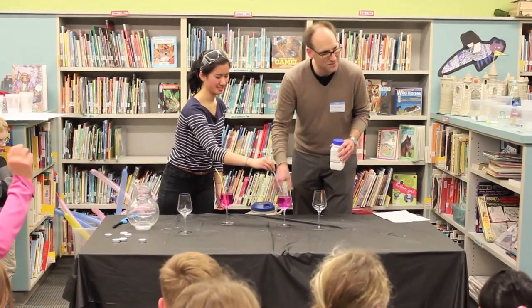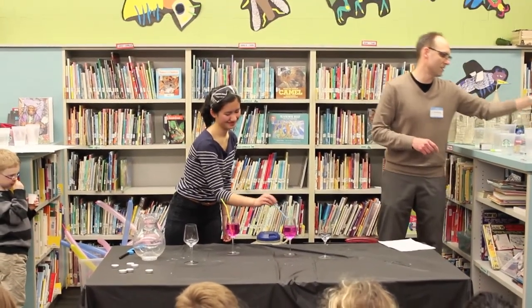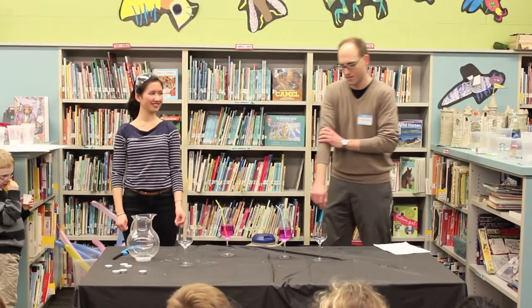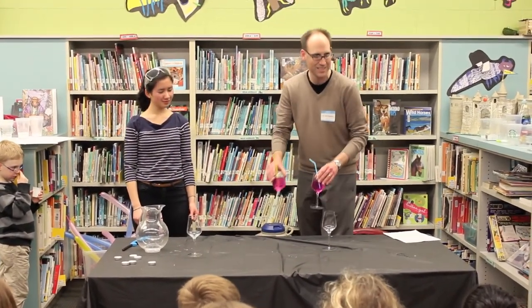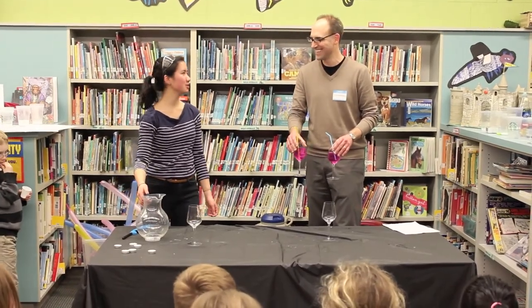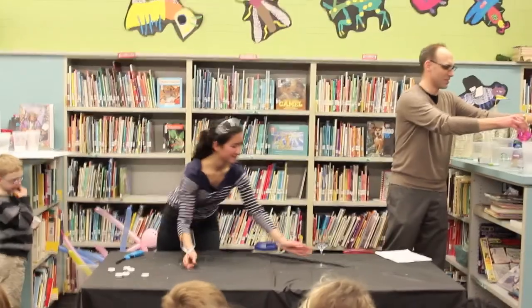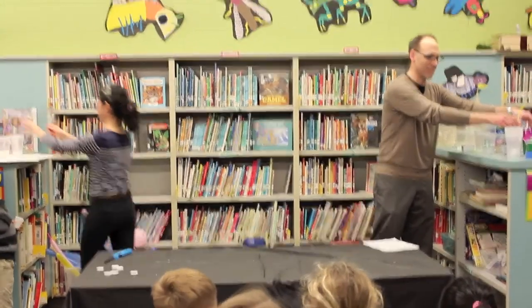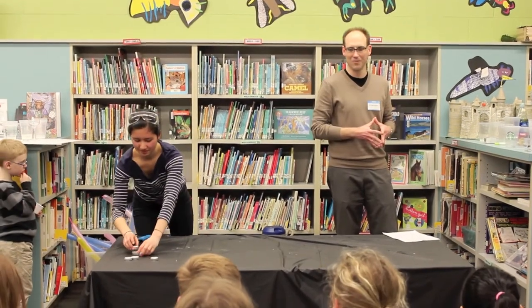Yes? Is it actually drinkable? I wouldn't. The base isn't going to hurt you. The phenolphthalein is in such low concentrations it probably won't either, but I wouldn't recommend it. I think regular juice is going to taste a lot better. But yeah, so we turned water to juice and then back into water through the use of a pH indicator, which is kind of cool.